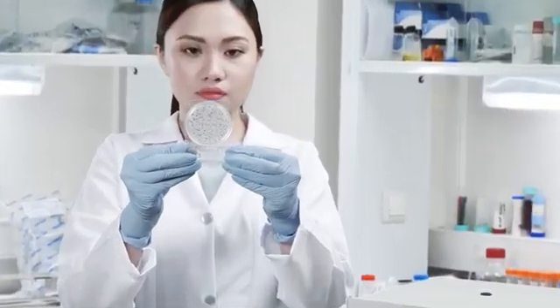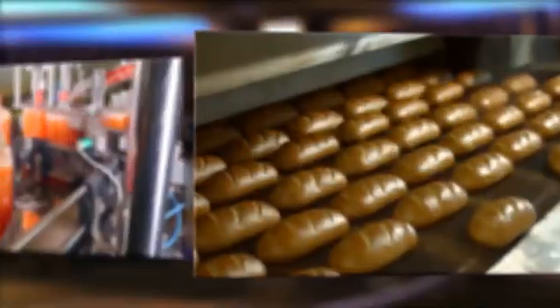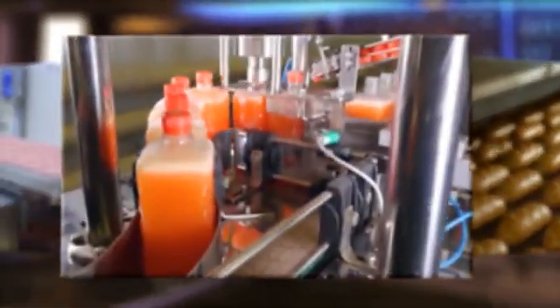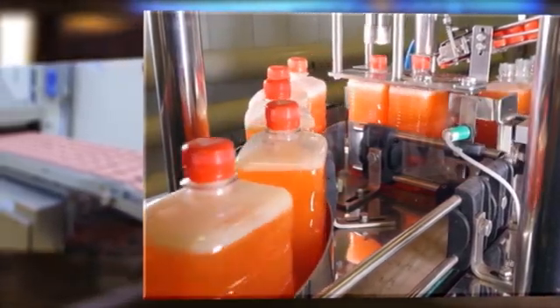With its superior quality and outstanding results, Compact Dry has been the most preferred choice of different industries for their routine microbiological testing. Bakery industry, Beverage industry, Dairy industry, Meat industry, Snacks industry.